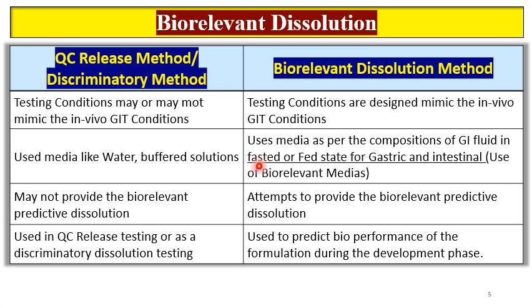So those medias are fasted gastric, fed gastric, then fasted intestinal and fed intestinal. So in biorelevant dissolution method, the medias are biorelevant.